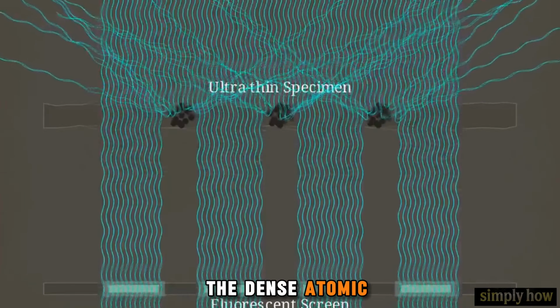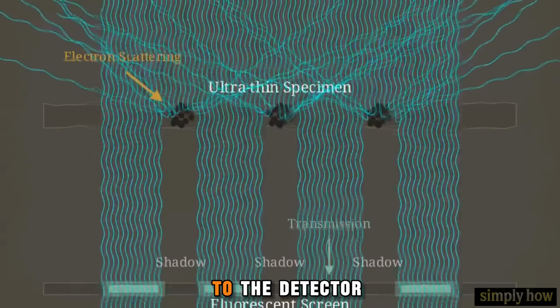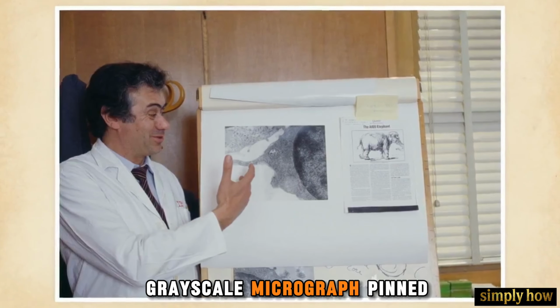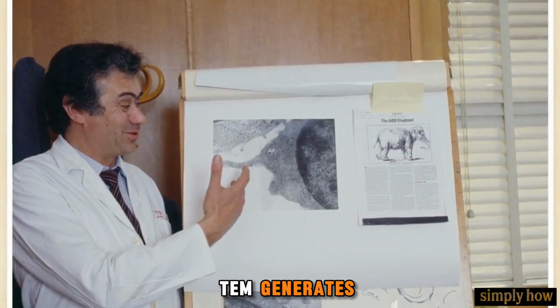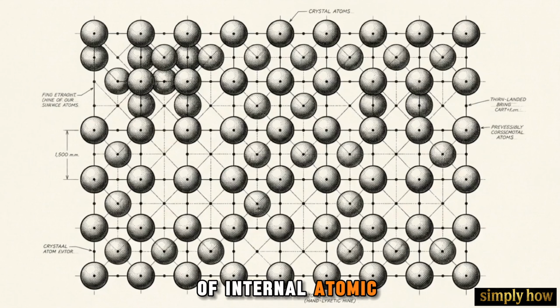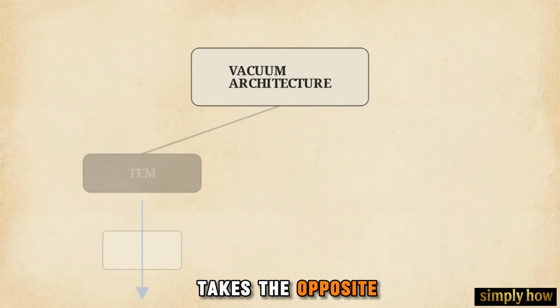The dense atomic areas of the sample scatter the beam, creating dark spots. The thinner areas let the electrons pass cleanly down to the detector below, registering as bright light. Look at the grayscale micrograph pinned to this flip chart. That is the authentic sub-nanometer two-dimensional cross-section that the TEM generates. While the TEM provides unparalleled maps of internal atomic structures, the intense physical slicing required leaves the sample highly vulnerable to preparation artifacts. The competing architecture takes the opposite approach.